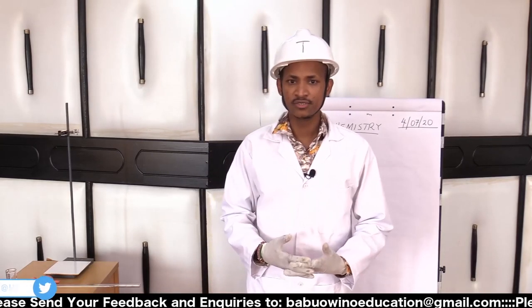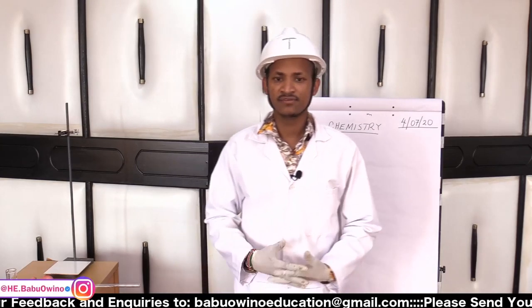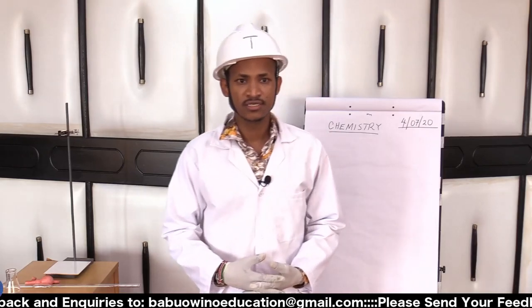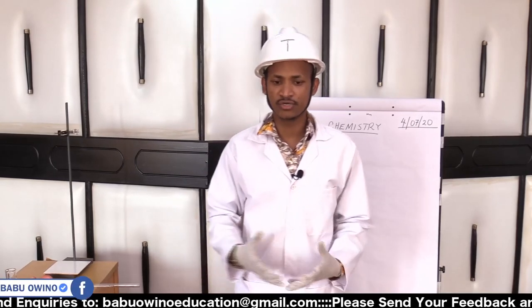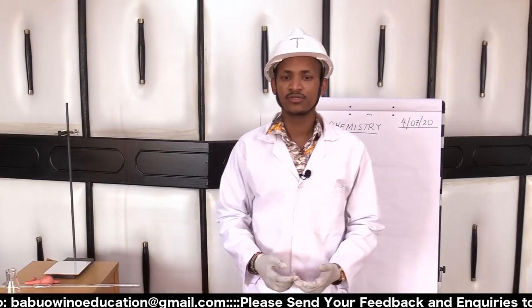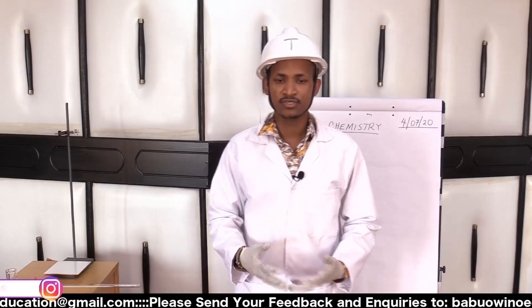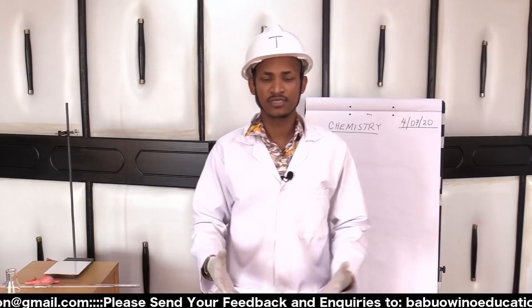In titration, today we'll handle three different types of titrations, two of which shall deal with neutralization reaction, that is a reaction between an acid and a base. Then again, we will deal with redox reaction.